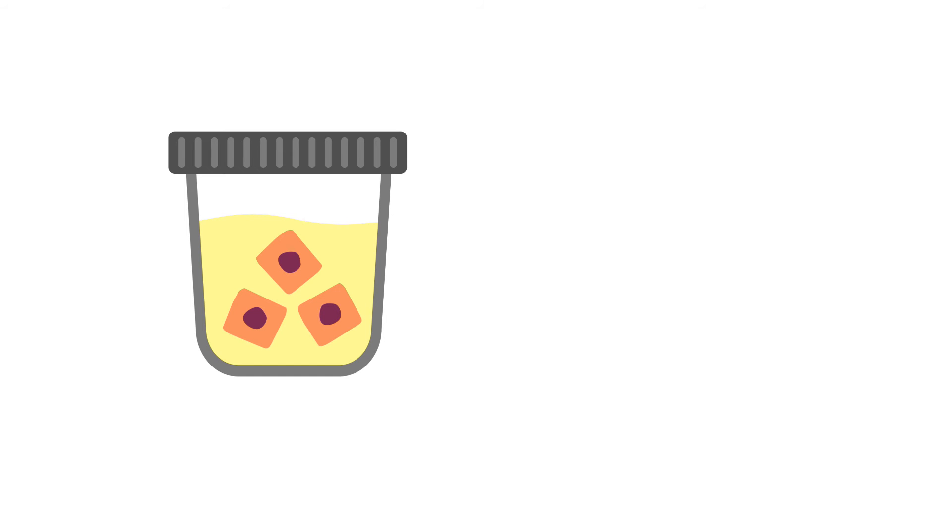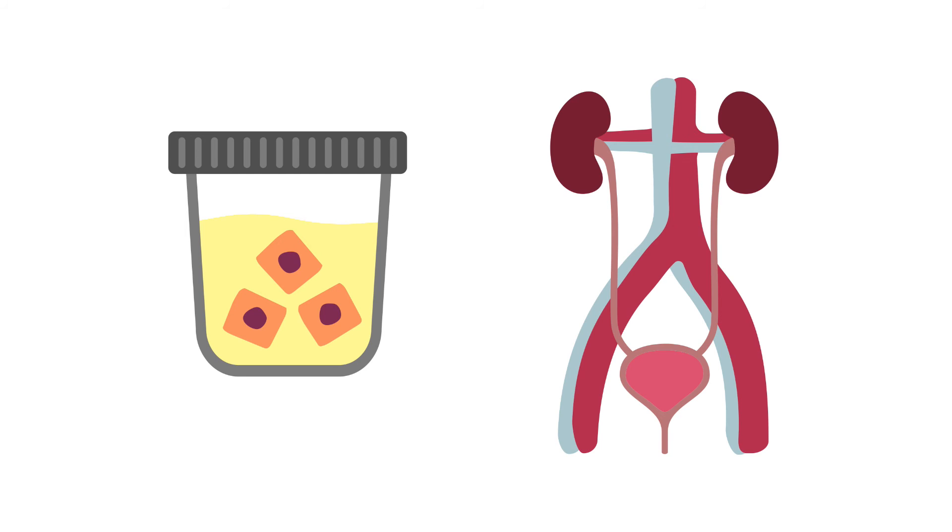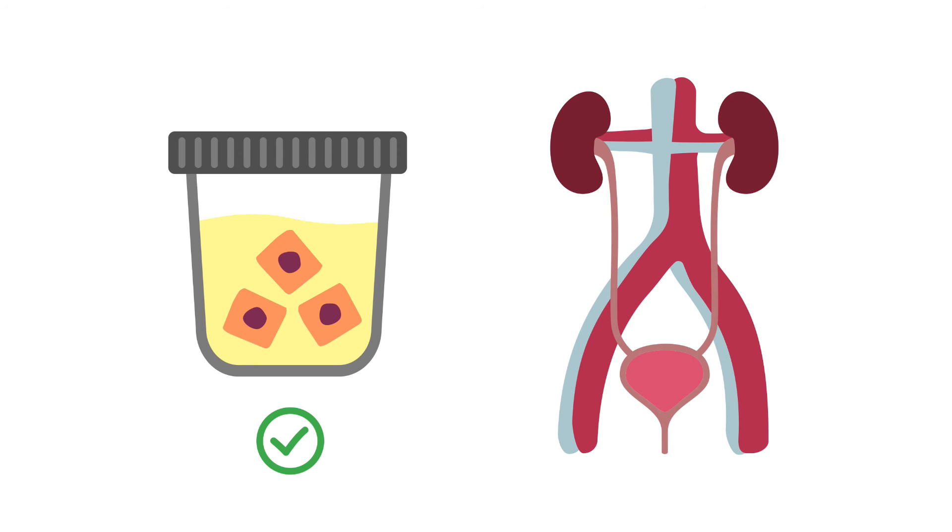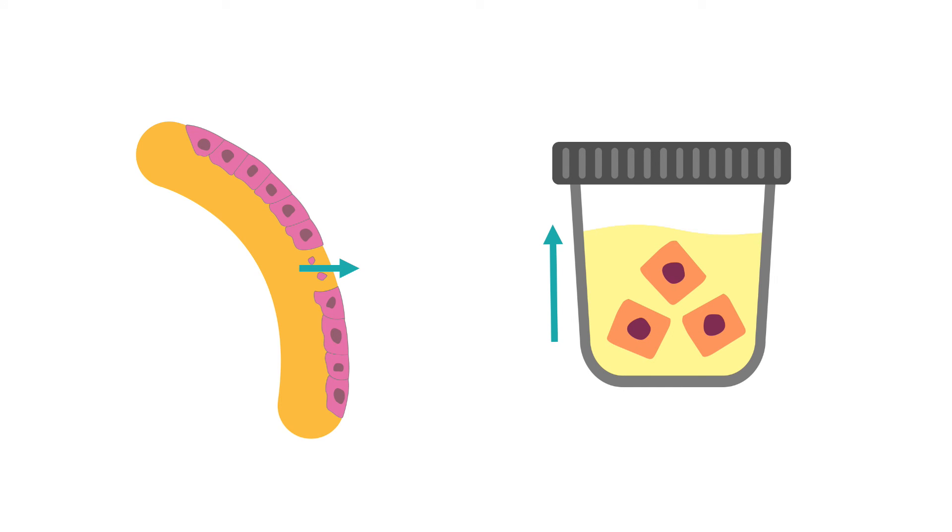Epithelial cells may appear in the urine after being shed from anywhere within the genitourinary tract. Thus epithelial cells are often a normal finding in the urine. In some conditions such as those associated with tubular damage, you may see increased numbers of epithelial cells in the urine.